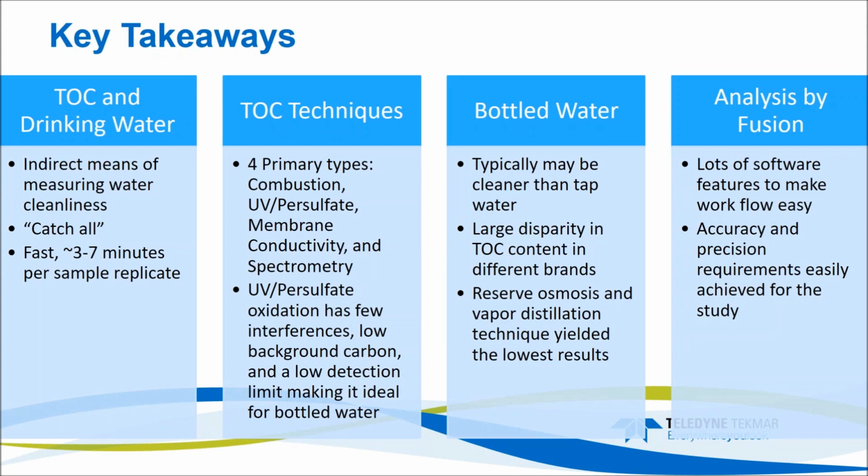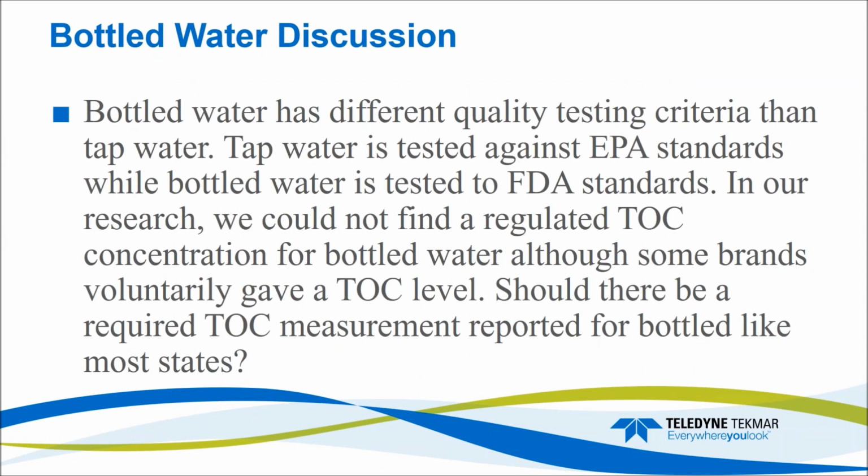And then before we go to questions, I just wanted to leave you with this thought. I did want to note that bottled water has different quality testing criteria than tap water. Tap water is tested against EPA standards, while bottled water is tested to FDA standards. So they're in a different category. They have different standards. But unfortunately, in our research, we couldn't find a regulated TOC content for bottled water. Although some of the brands voluntarily gave a TOC level, like if you go to their website, they want to say our TOC level is less than this. They want to show that it's very high quality, it's very clean. So some of them voluntarily disclose this information, although they're not required to.